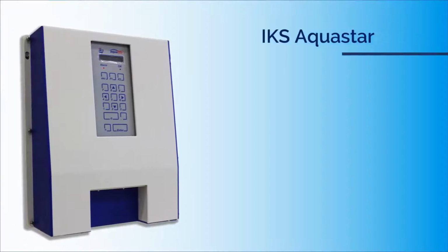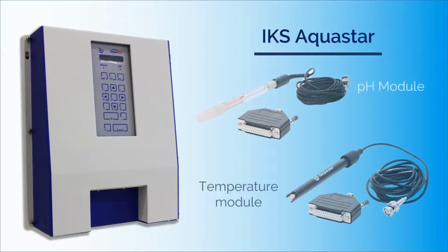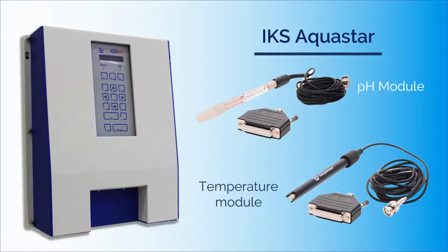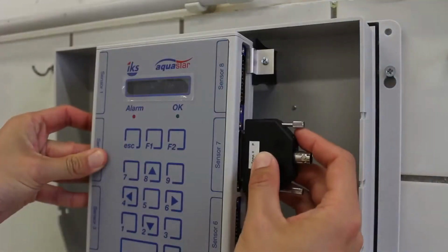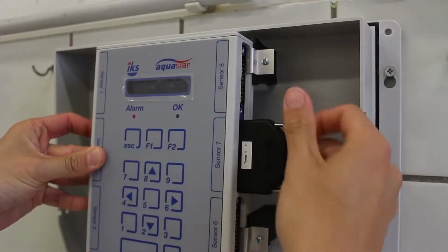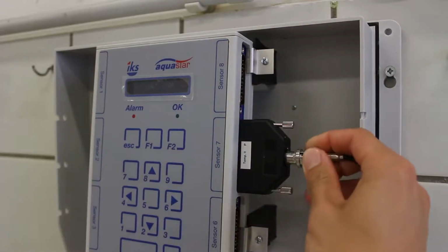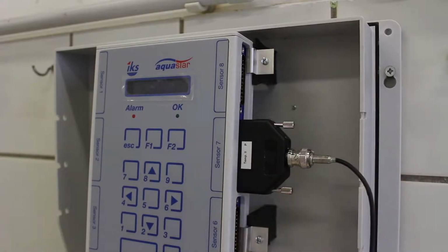Now that you're familiar with the parts of IKS Aquastar, let's proceed to connecting the modules. Important reminder: turn off the equipment before connecting or disconnecting any module to avoid damage. Each measurement module comprises a sensor and its appropriate converter. These two are separate for pH, temperature, redox, and oxygen sensors. Water level and conductivity sensors are firmly connected to the converter. First, connect the converter to IKS and tighten the 2 screws. Then, connect the appropriate sensor to the converter. Do the same for the other sensor.